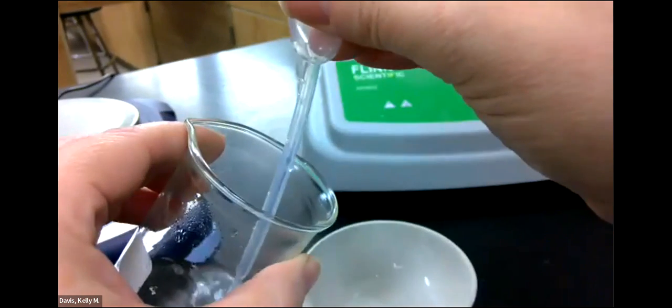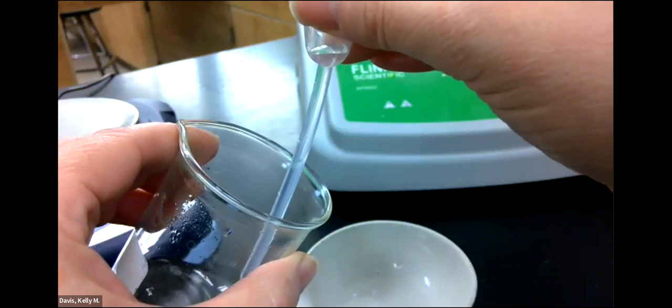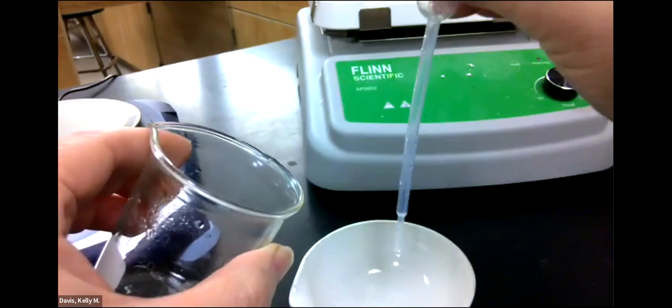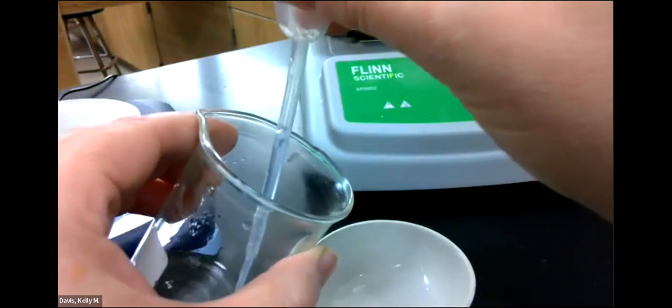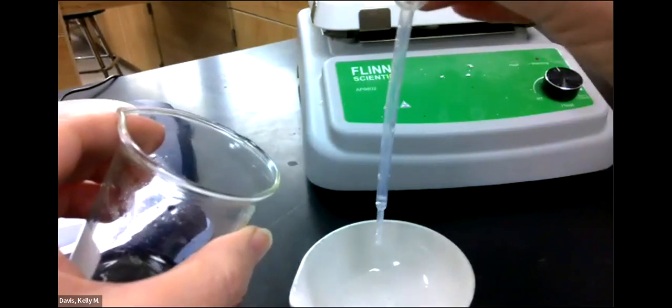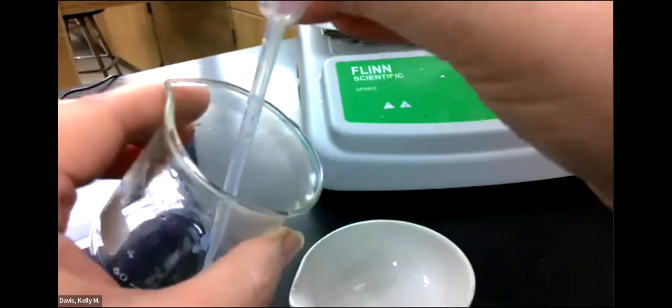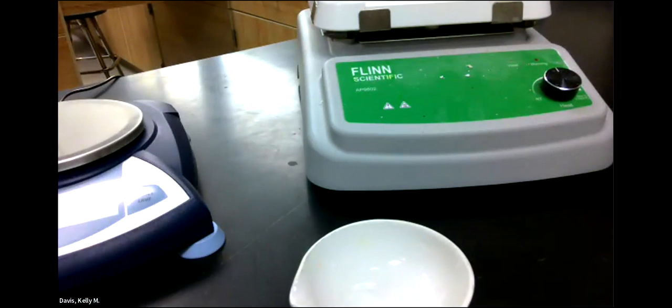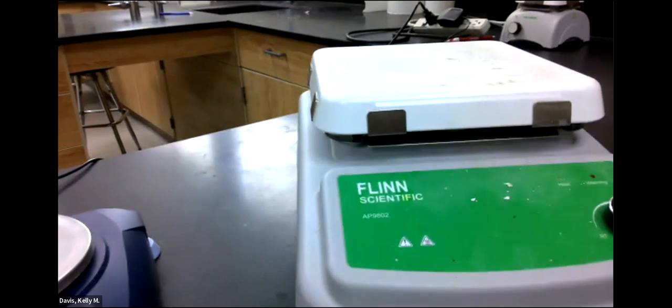All right, so all of my aqueous magnesium chloride is now in my evaporating dish. If you can see that, it looks like water. And I'm going to put that on the hot plate.